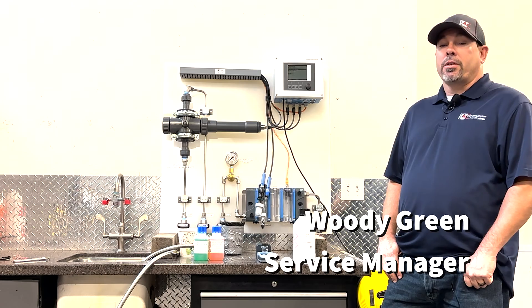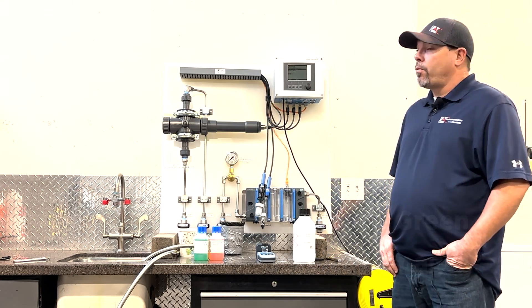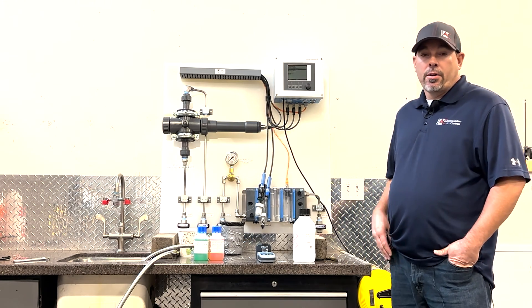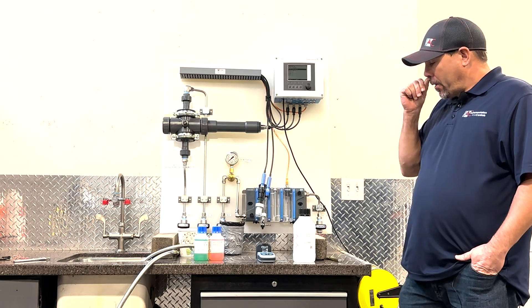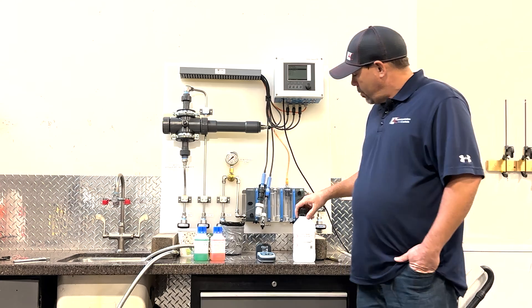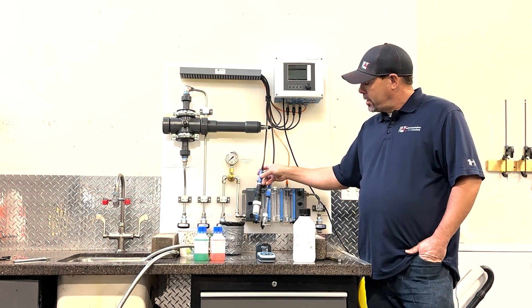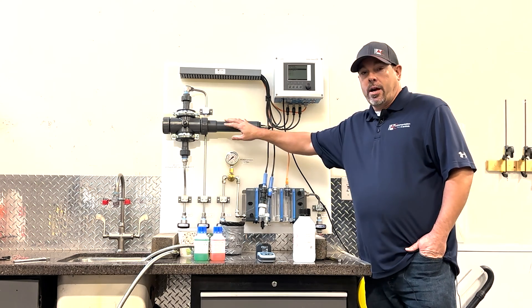Hi, this is Woody Green with Instrumentation and Controls in Chandler, Arizona, and today we're going to go over how to calibrate a few different sensors with the Endress+Hauser CM48 model. Today we are looking at three different sensors: a pH sensor, a disinfectant chlorine sensor, and a nitrate sensor.